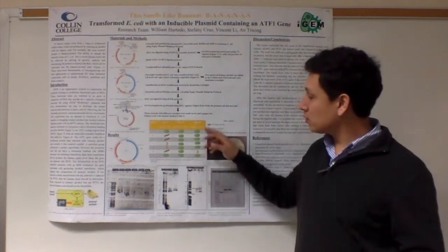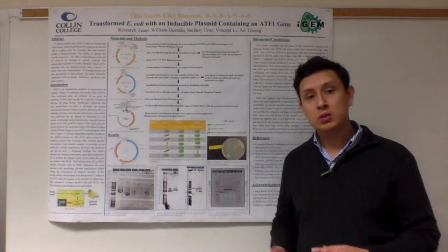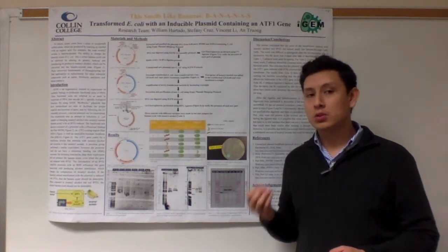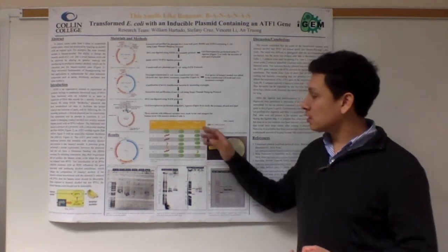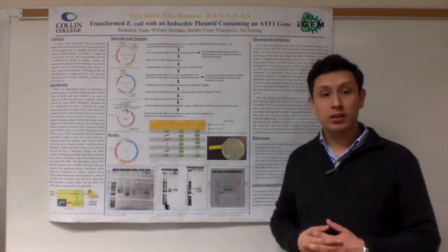The one deviation in Tube 3 can be explained by the fact that when you mix IPTG with isoamyl alcohol, it does indeed create a sweeter scent. However, since the bacteria is not transformed to continue producing that smell, the smell will not linger.